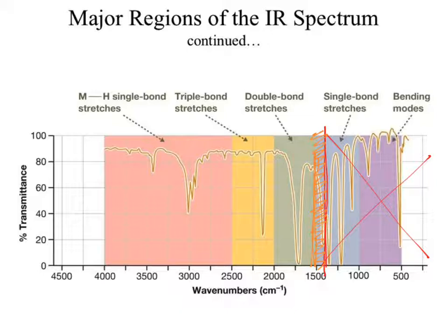When we look at the English language and how these signals are described, intense, very intense, moderate intensity, broad, sharp, those words lose a lot of meaning because what you're looking at is an image and your interpretation of those words can be different. So the best way to deal with IR is to treat it like the little kid toys where you have the shapes. Does the square fit in the circle hole? No? Then the square is not a circle. You're saying, well, that's a bit oversimplified. Yes, but that's how you should be looking at IR.